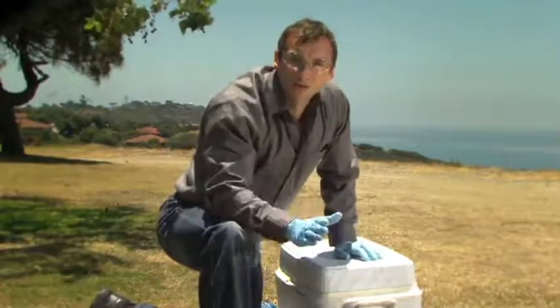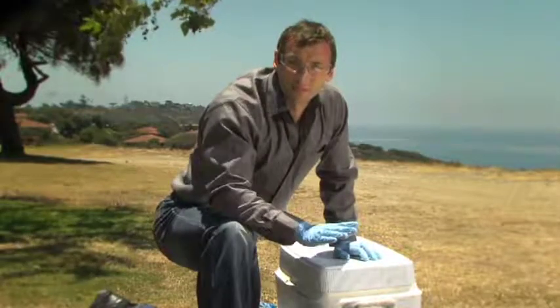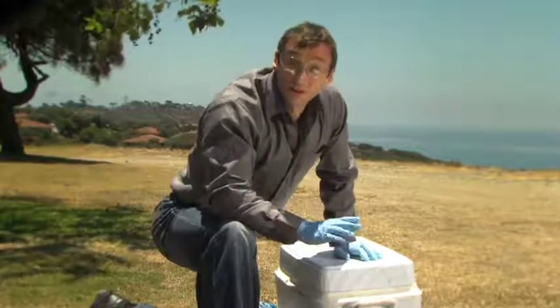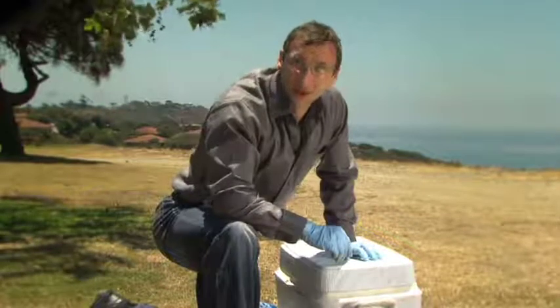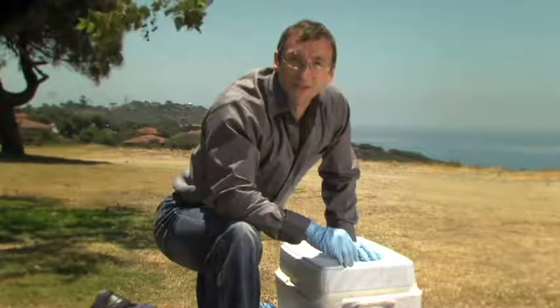When packing the cooler chest, we put the sample bottles in only one layer. We don't stack the bottles on top of each other. We use plenty of ice, regular ice, not blue ice or dry ice. Now we just have to seal the chest and transport it to the laboratory.